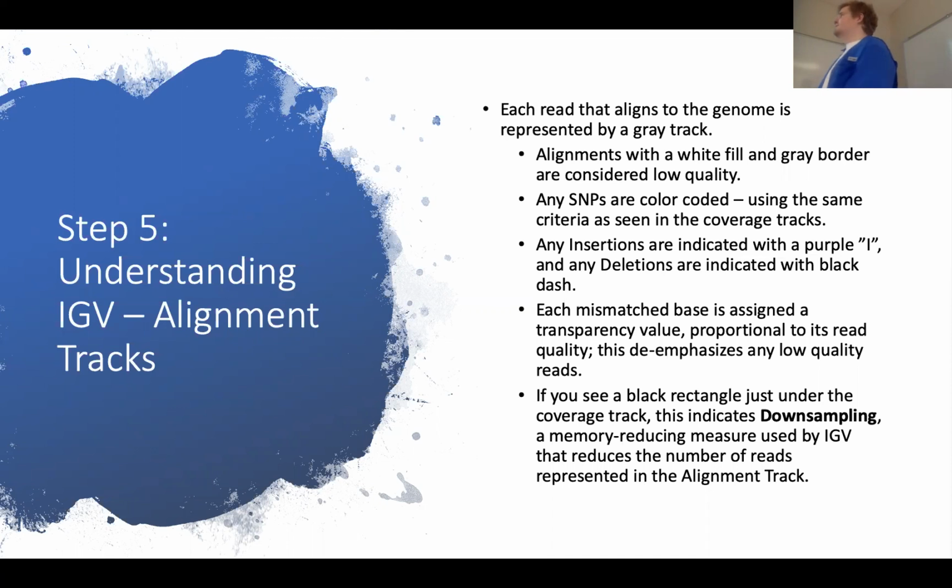You also have insertions and deletions. They're represented by a purple I for an insertion or a black dash for a deletion. When you zoom in closer to the region with an insertion or deletion, they will also have a number, and that number will tell you how many bases have been inserted or deleted. I'm going to show you all of that in the next slide.